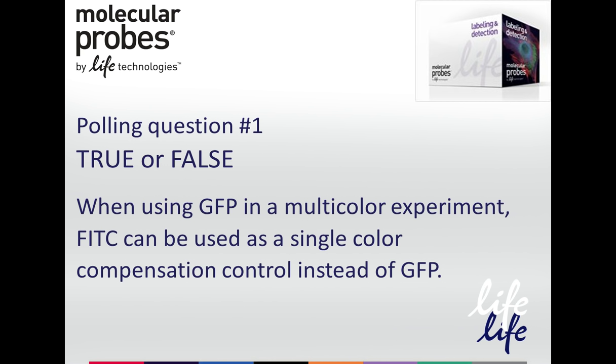And from the response, we have 77% say false and 23% say true. And the answer to this is actually false. The single color control needs to be spectrally matched to the experimental reagent. And although GFP and FITC are used in the same detector channel, the emission spectra for each of these are different. So it is best to use GFP-positive cells for proper compensation when using GFP.